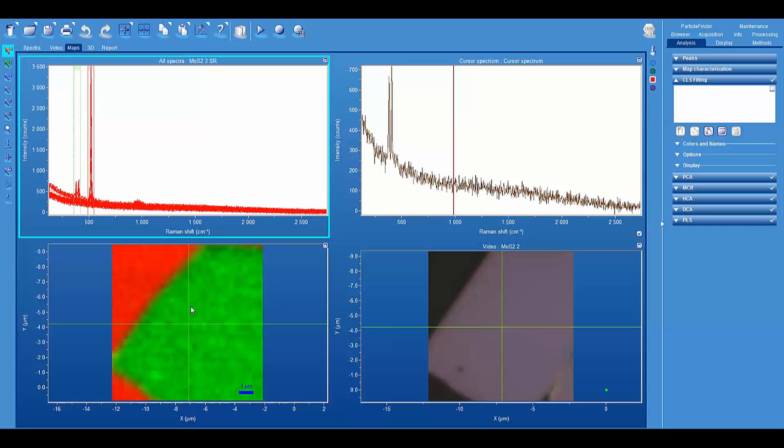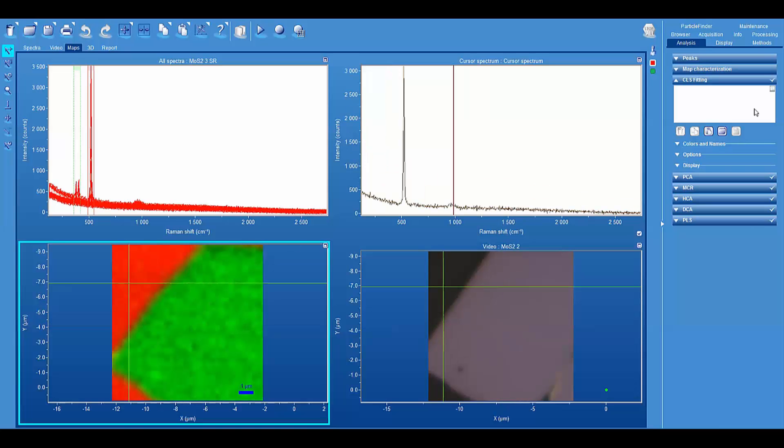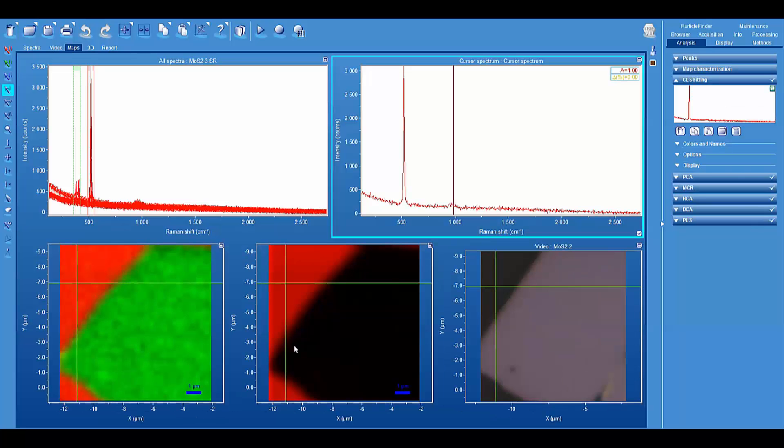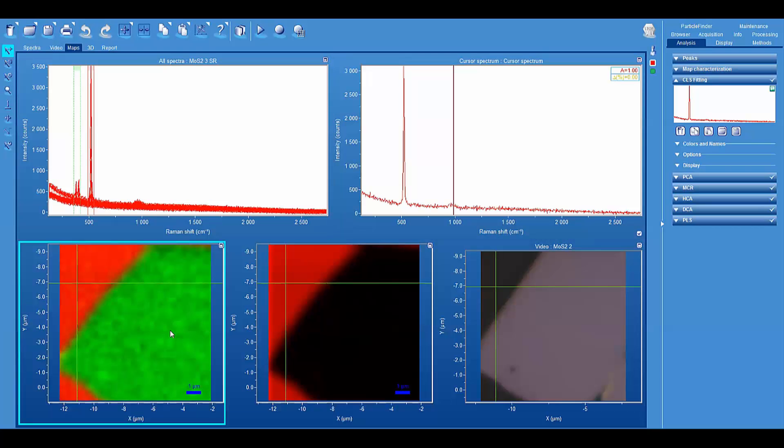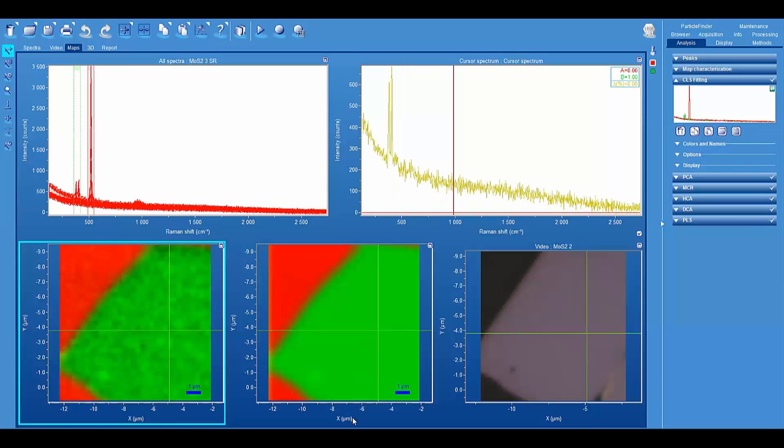Okay, so now we again generate our classical least squares image. Okay, there's our silicon component. So now our molybdenum disulfide component. And again, this is for 50 millisecond per point integration time. So that's pretty fast imaging.